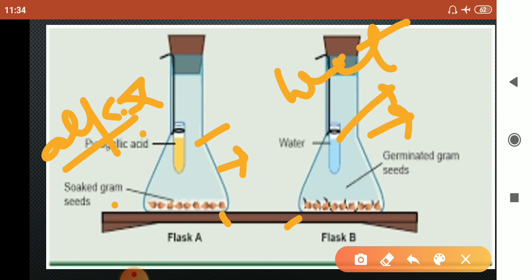Alkaline pyrogallic acid has the tendency to absorb the oxygen in the conical flask. It will absorb the oxygen in one flask. The other has plain water. That is a controlled setup.